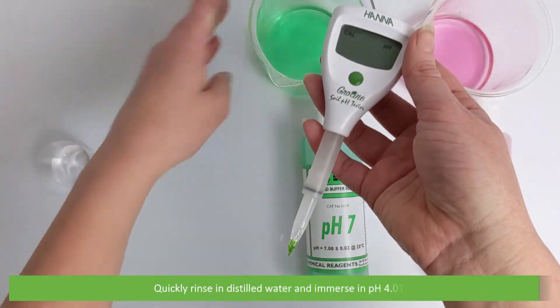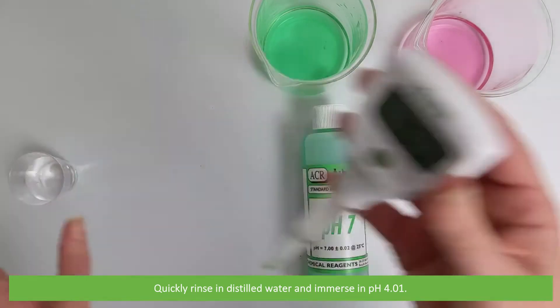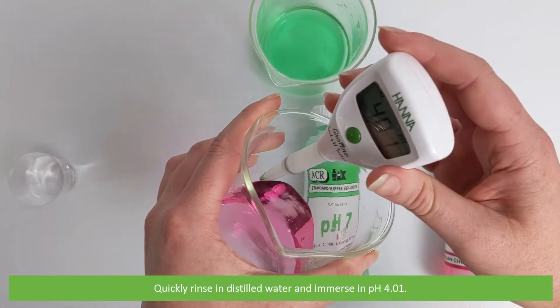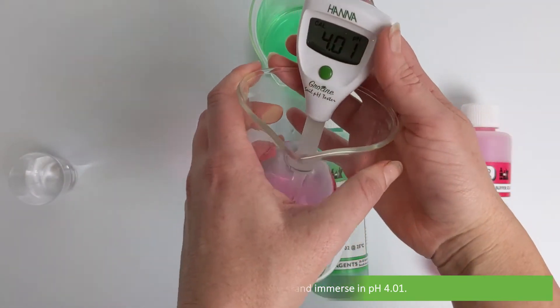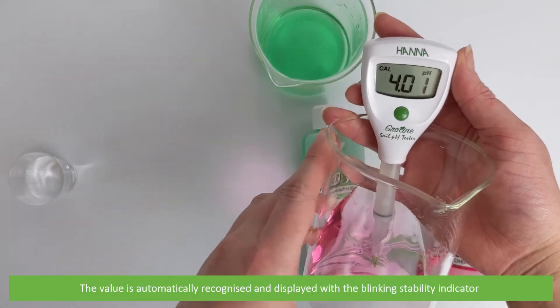Quickly rinse in distilled water then immerse into pH 4.01. The value is automatically recognized and displayed with the blinking stability indicator.